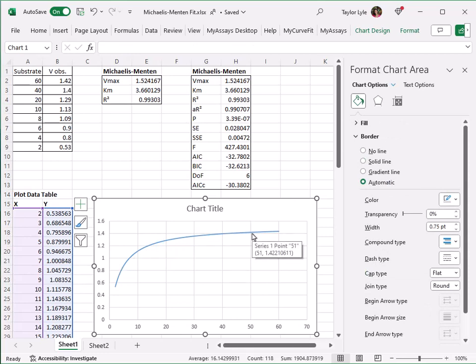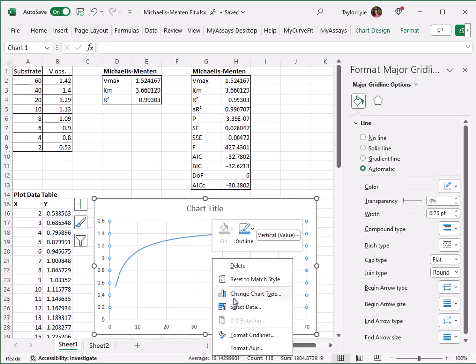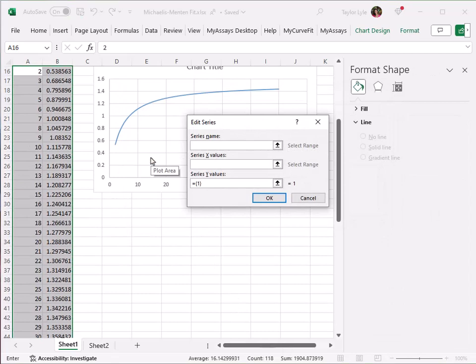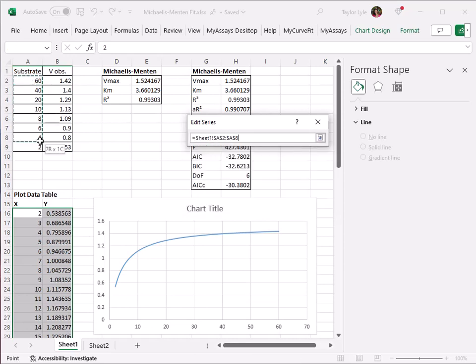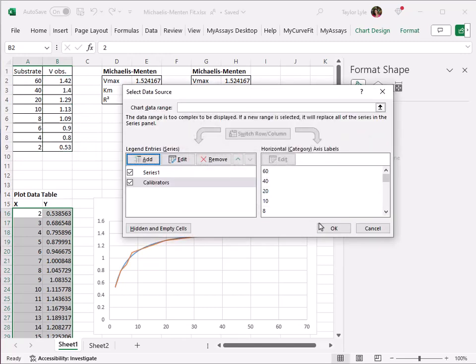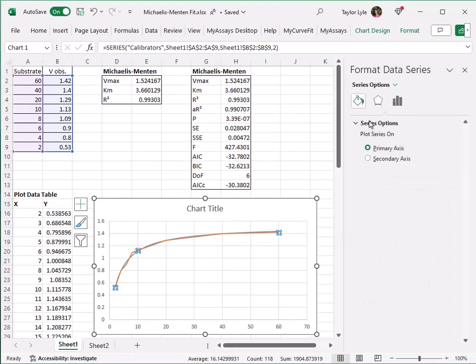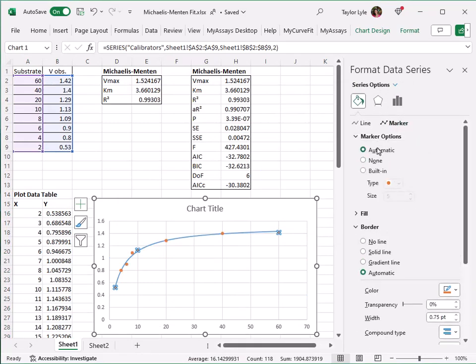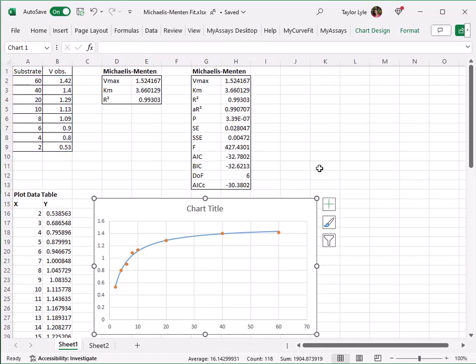This data represents the true curve fit line as opposed to a line simply connecting our calibrator points. Now I'll add my calibrator values as an additional data set by selecting Select Data, Select Add. I'll name this series Calibrators, and I'll select my calibrator X and Y values. I'll format this data series to remove the line and add markers. Now on our chart, we can see both the curve fit line as well as where the calibrators fall on that line. For more information on how to create plot data tables and the corresponding curve chart, please see the associated video.